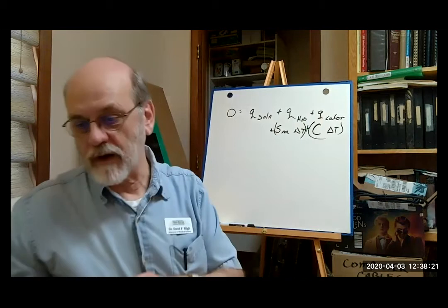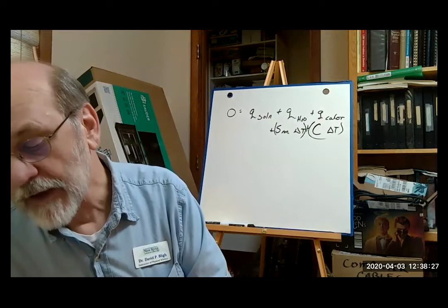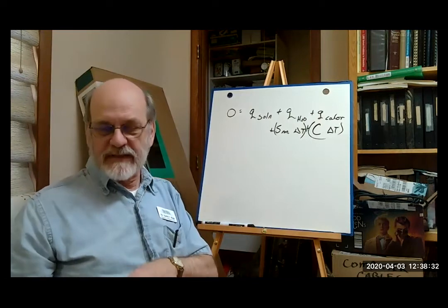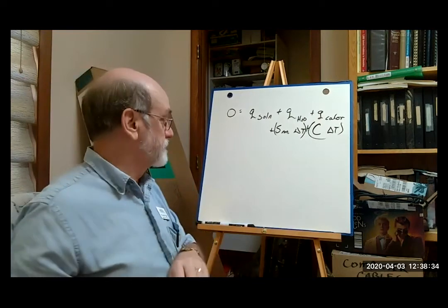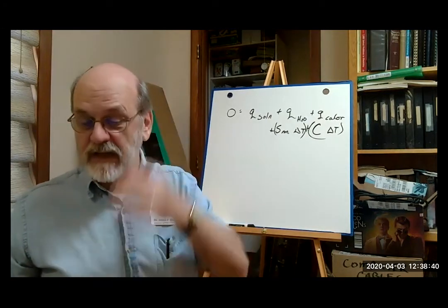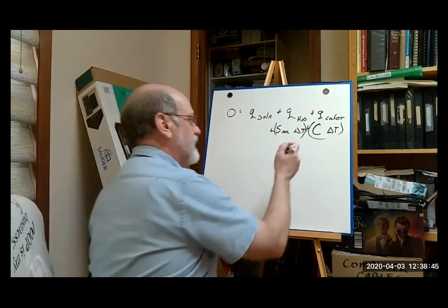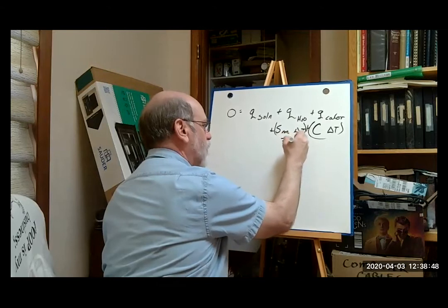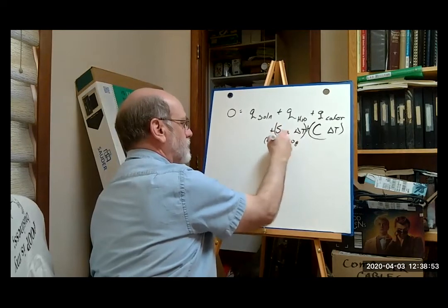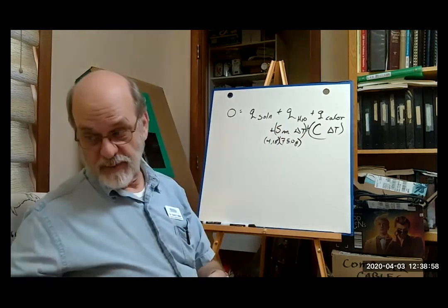Right, so what's the mass of the water? Well, the experiment says that you're going to use 75 milliliters of water, right, and approximately 10 grams of sodium carbonate. But it has to be measured exactly, and you need exactly 75 milliliters of water. So 75 milliliters means 75 grams of water, and then 4.18 for the specific heat capacity, and then delta T, whatever that happens to be, based on the data that you're given.